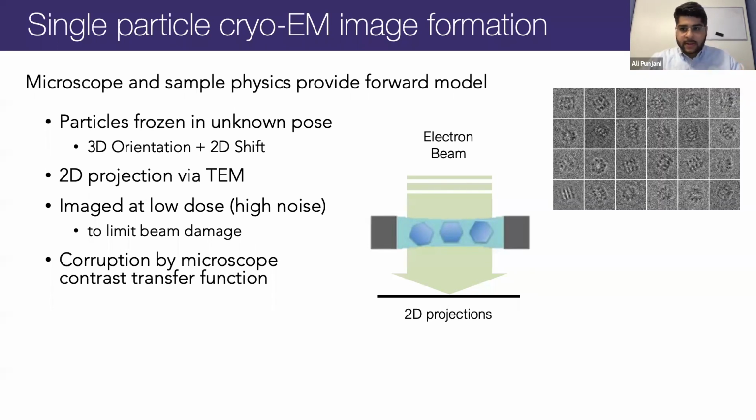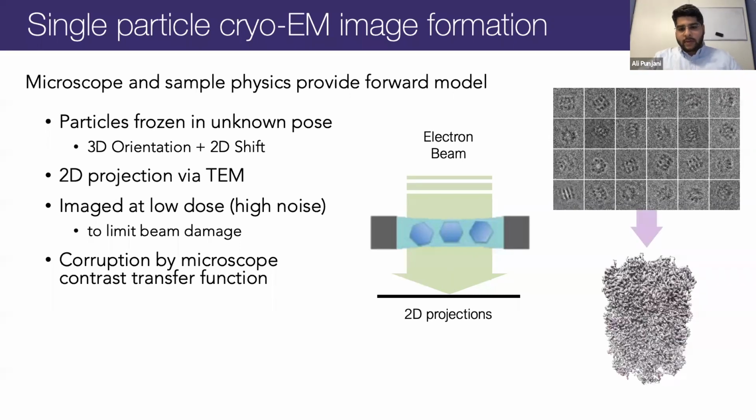The particle images that come out of this ideally are very clean, and we can see individual proteins and hopefully purify them down to remove junk and other non-particle images. And at the end of the day, what we will be left with is a set, usually tens of thousands or hundreds of thousands and millions of particle images, that make it possible for us to carry out the task of reconstructing a 3D structure of the protein target that is in the sample.